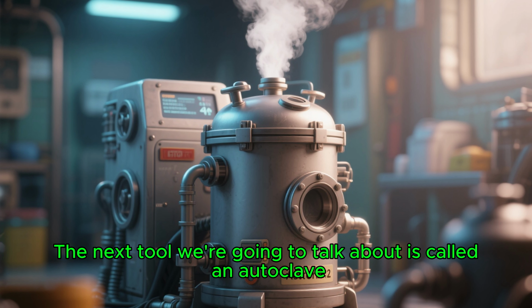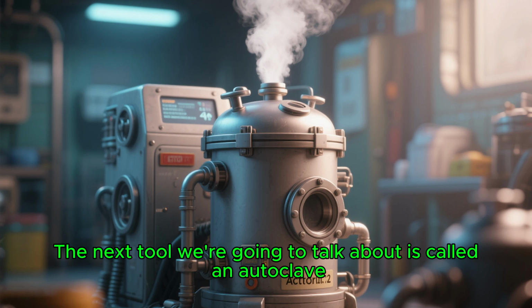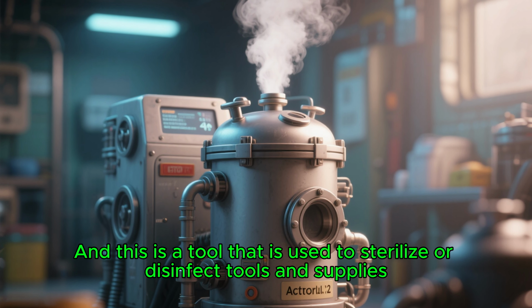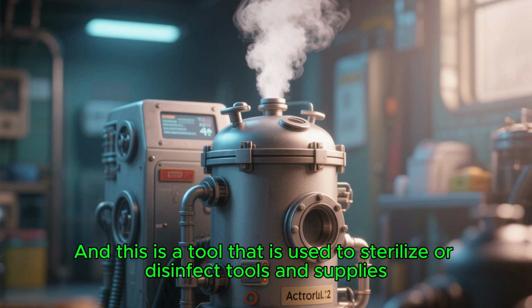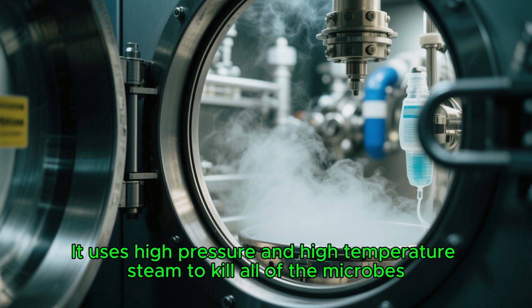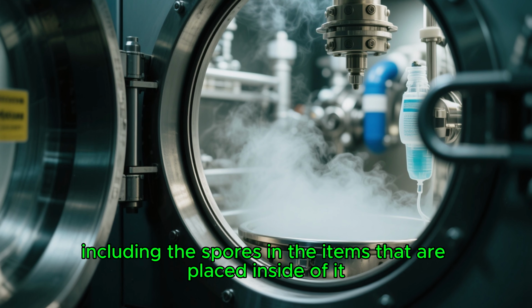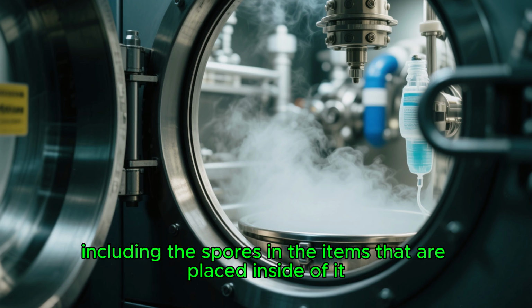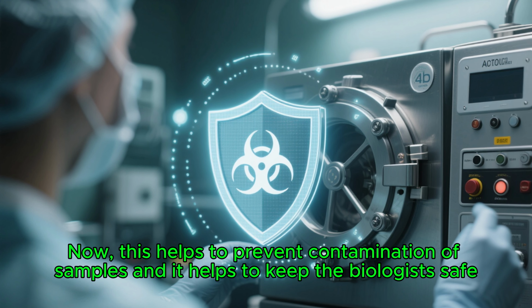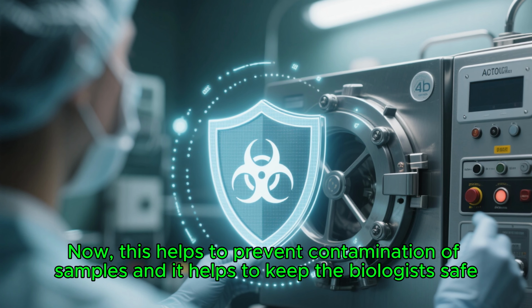The next tool we're going to talk about is called an autoclave. And this is a tool that is used to sterilize or disinfect tools and supplies. It uses high pressure and high temperature steam to kill all of the microbes, including the spores, in the items that are placed inside of it. Now, this helps to prevent contamination of samples, and it helps to keep the biologist safe.